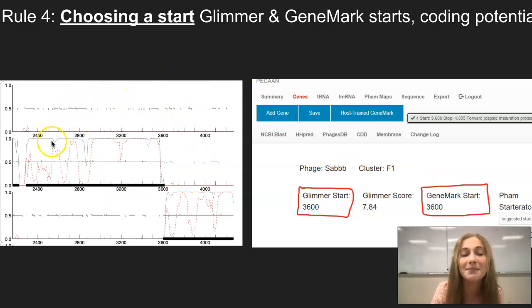All of these black numbers right here are different potential starts. And then the red dotted lines and black lines are the coding potential. As you can see, the 3,600 start right here has very high coding potential with these high red and black peaks. And with high coding potential, it is even more evidence in why we should choose that start for that gene.